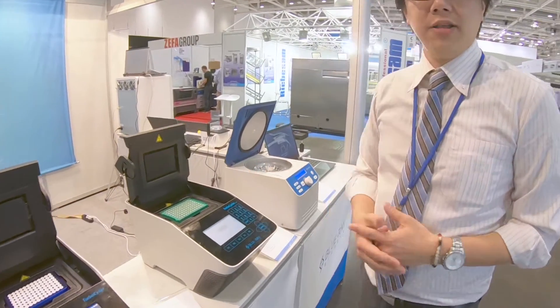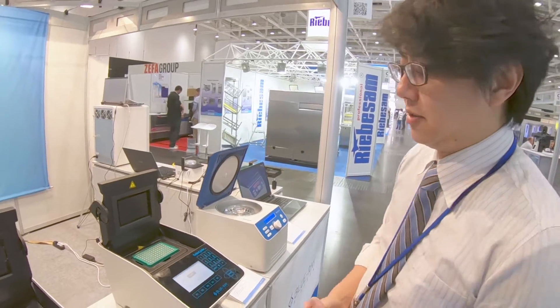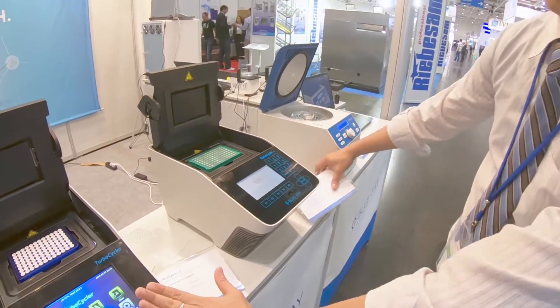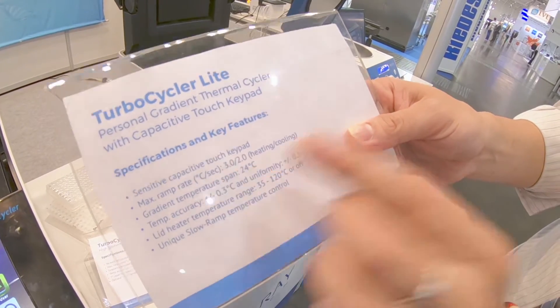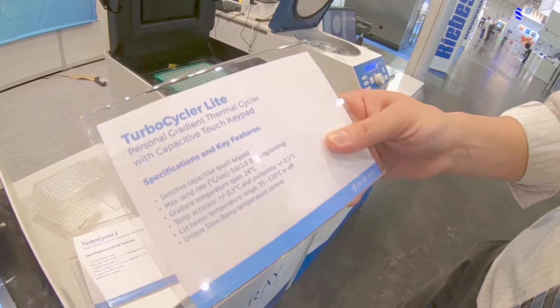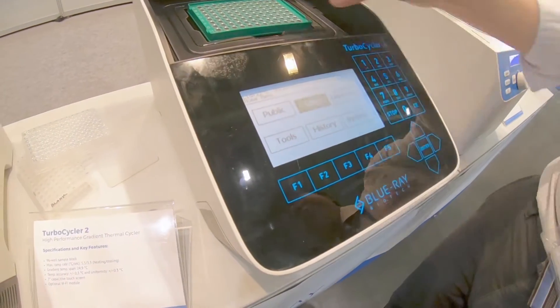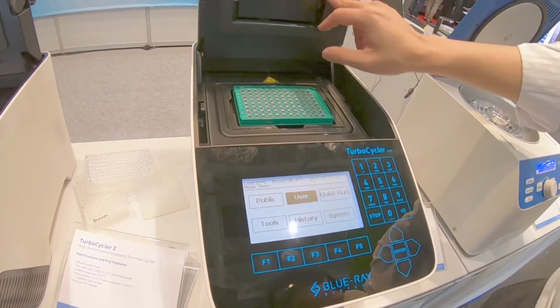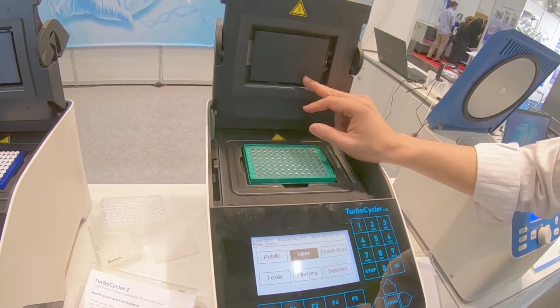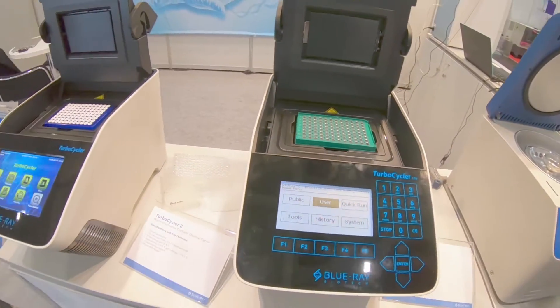The other PCR model is the basic type, called Turbo Cycle Lights. The major difference between the two is the ramping rate — this one is 3.0 degrees per second. Although it is the economical type, it still has a gradient function and the lid temperature is adjustable.